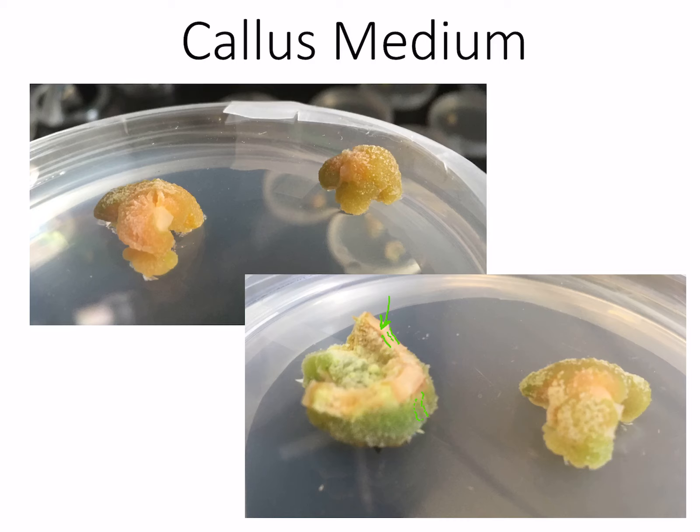We can also see that there's other genetic reprogramming going on here, other than just the reprogramming from root parenchyma cells to these meristematic-like callus cells. Because instead of having carrot root cells with chromoplasts filled with carotenoids — we still see some evidence of that up here — we're now seeing a green tint, which suggests that some chloroplast development may be starting.